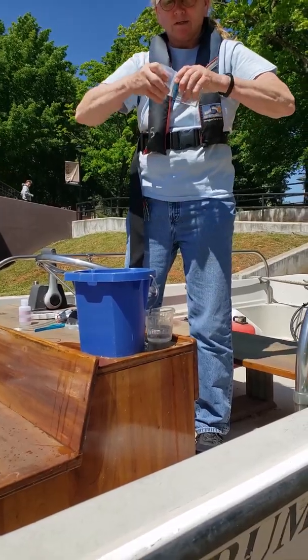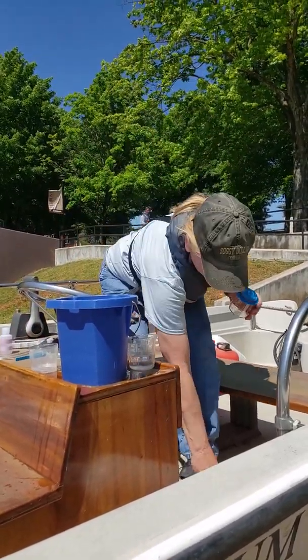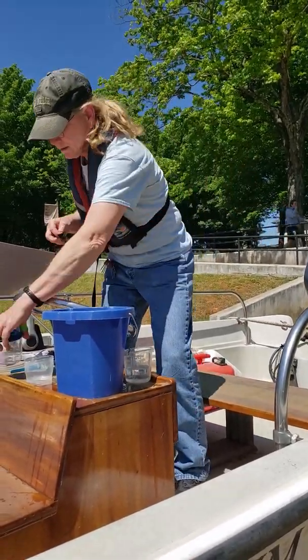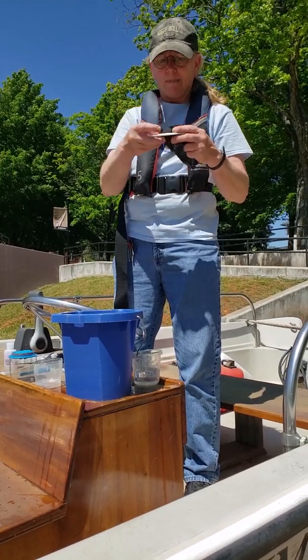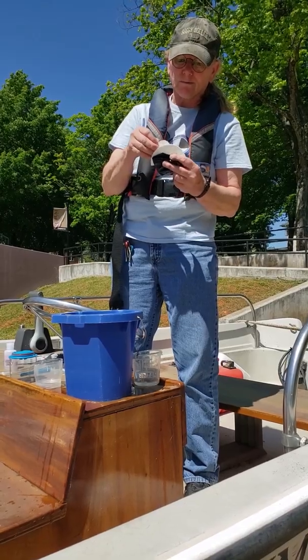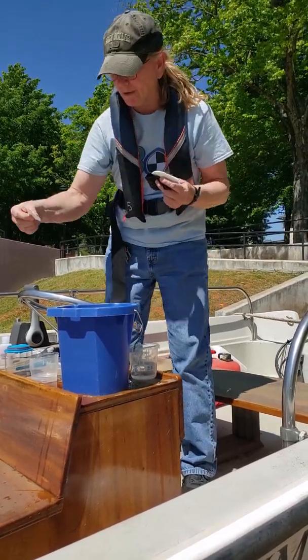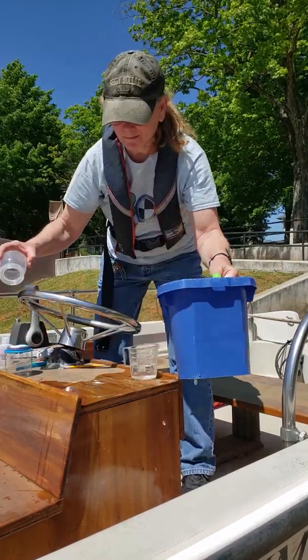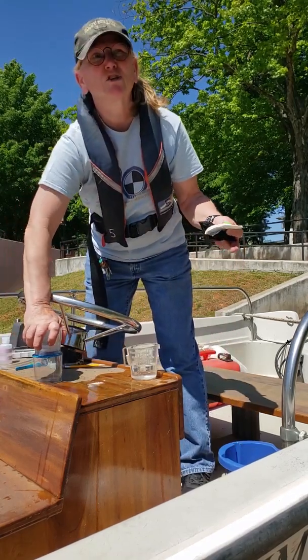Assemble your filter apparatus. The top part pops off — it doesn't screw, it just pulls off. Take your filters that come in a black bag. You're going to take one of the inside smaller filters and place it rough side up on the top of the filter unit, and then push the top on securely.